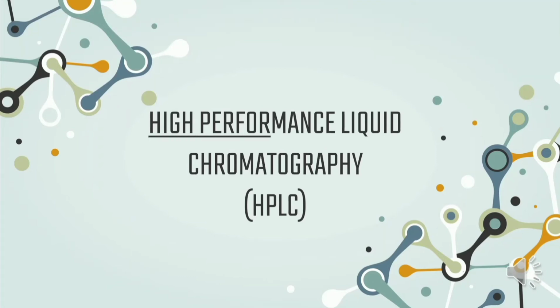Assalamualaikum warahmatullahi wabarakatuh. We are students from Group 5B and want to present about Experiment 6, entitled High Performance Liquid Chromatography, which is HPLC.